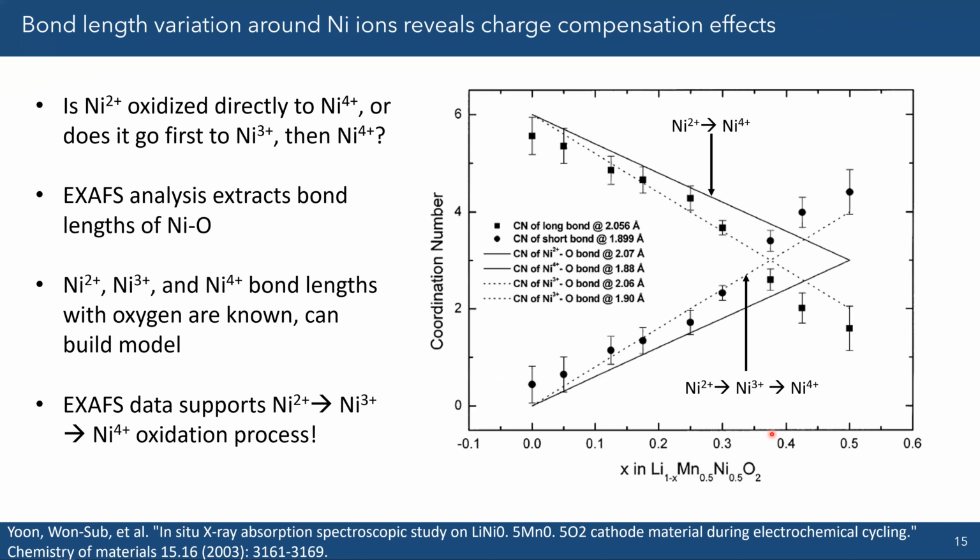But in addition to the near edge structure, they also did quantitative fitting of the XAS structure, and they were able to get bond lengths around your nickel and how those bond lengths vary as a function of charge. And they actually did a pretty cool study here where they use this bond length change to figure out the charge compensation effects in this material.